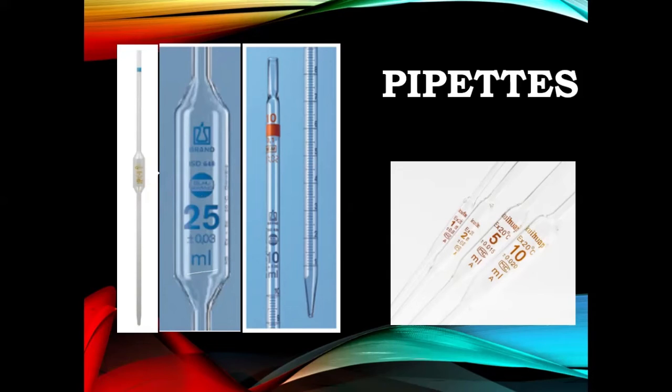But that doesn't mean you say that this is not good. Both of them are good. If you want to transfer a specific volume, then we don't need it. It's enough. Okay. And pipettes can be of 10 milliliter, 25 milliliter. Even the micro pipettes are there, which can measure accurately 1 milliliter.